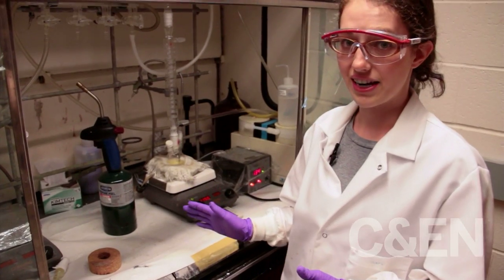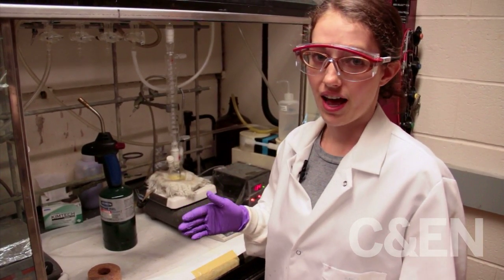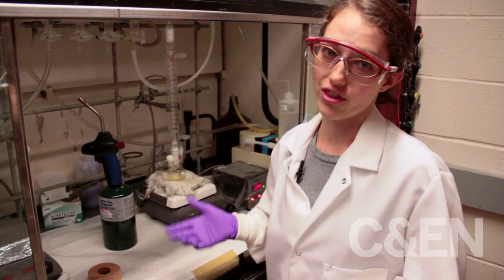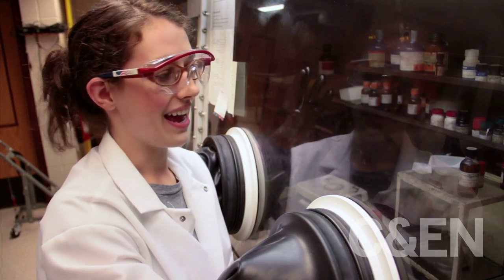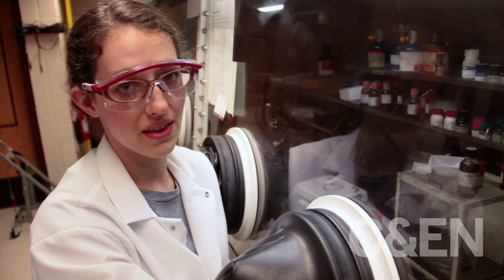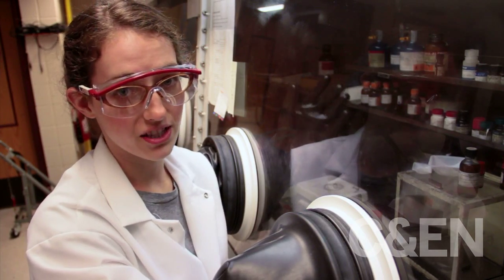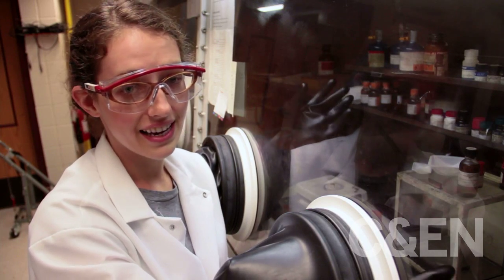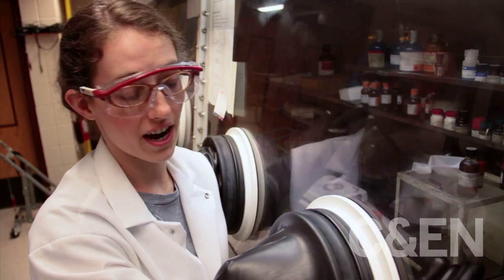Now that that's ready, I'm going to head over to make the selenium for the injection. This is a glove box — it's filled with argon and it serves two purposes. The first is to protect us from the chemicals; some of them give off bad odors that could be harmful to the body, so we keep them in the glove box. The second is to prevent the chemicals from degrading in the presence of air.